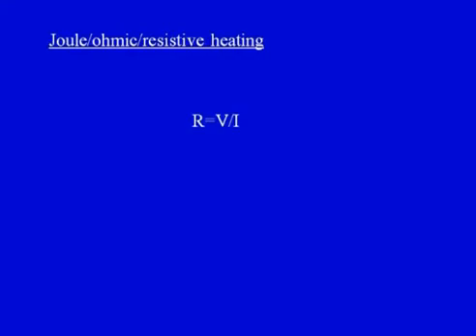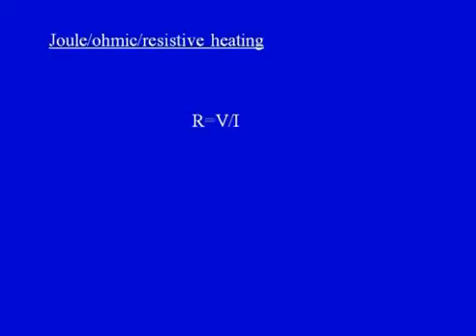All right. So, one factor was the electrophoretic mobility. Now, another factor which is important in the migration of the charged species or electrophoresis run is the heating, which is called Joule heating or ohmic heating or resistive heating. When the current in the solution between the electrodes is conducted mainly by the buffer ions, a small proportion being conducted by sample ions, then Ohm's law expresses the relationship between the current, voltage and resistance, which is given by this particular equation.